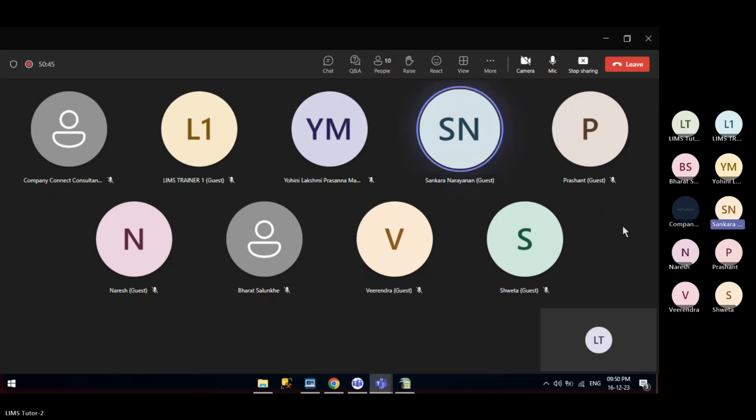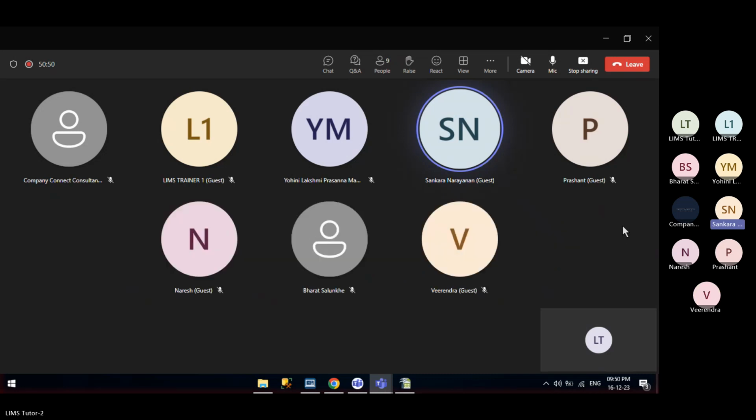So with respect to configuration or the sample flow or lot flow management, you will explain the functional part, not the technical part. On the technical part, we will only be able to cover the subroutines. If you want to create a new subroutine, add a new menu, or, while creating master data, add a new calculation, formula calculations, format calculations, that we will cover.